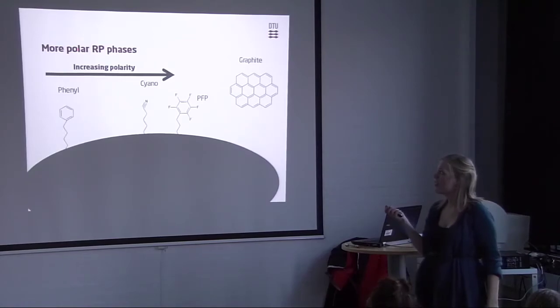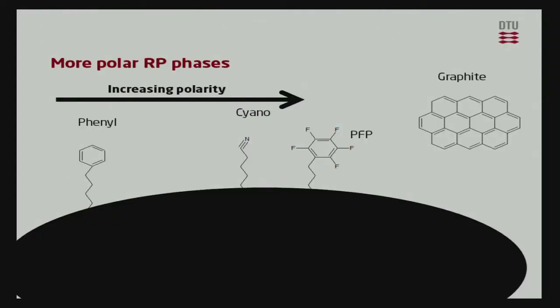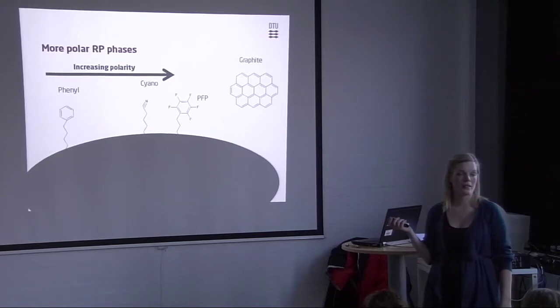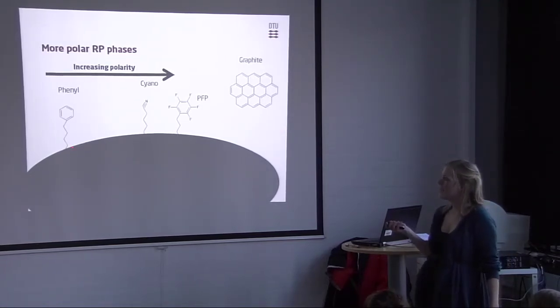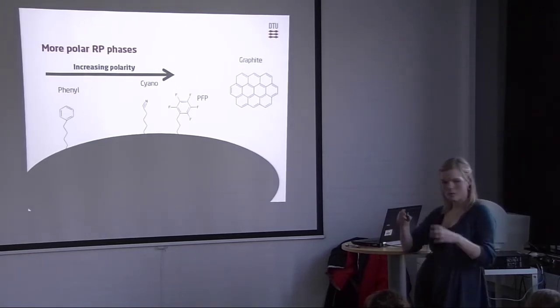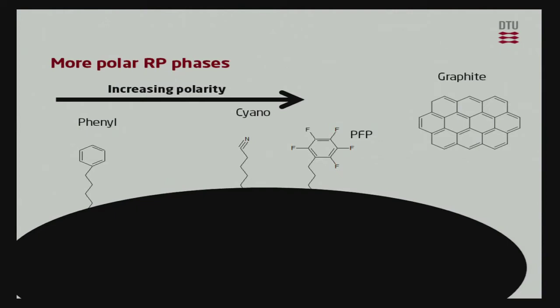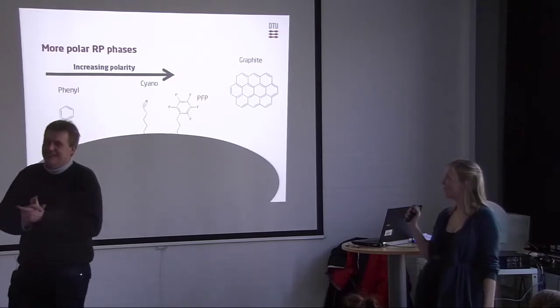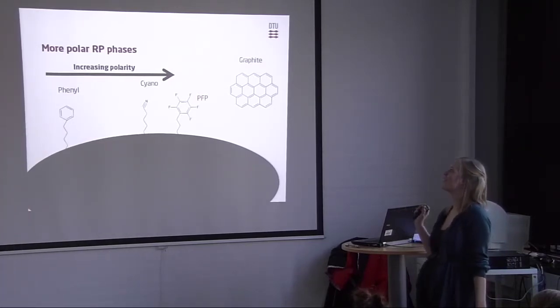So you can actually modify your reverse phase stationary phase to interact with more polar compounds. So again, because HILIC is black magic, sometimes it's worth just looking at some of the more polar reverse phases. So that can be a phenyl, a cyano, or a pentafluorophenyl, or graphite. So sticking on the bead, you can have all these different types of functional groups. And moving from left to right, they are more and more polar. But graphite is also voodoo, so that can do a lot of strange things. But it exists. It's always nice to know that it exists.